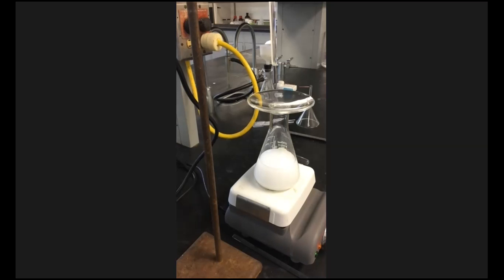If the water goes there and it cools down, it'll drip back down into the glass. So we got a 15-minute period for that, and I'm gonna check the temperature after about 3 minutes, and then we're gonna follow that next step of the procedure.